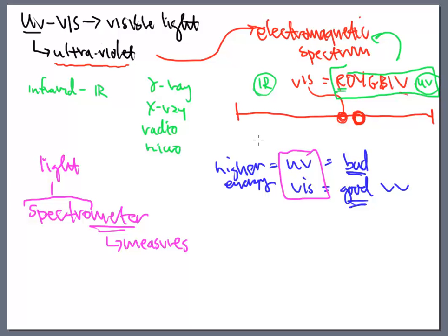In the laboratory, we do have infrared spectrometers. It is a meter that measures the infrared portion of the electromagnetic spectrum. We have nuclear magnetic resonance spectrometers. Well, this is a meter that measures nuclear magnetic resonance, which really happens in the X-ray portion, it happens in the radio wave portion of the electromagnetic spectrum.